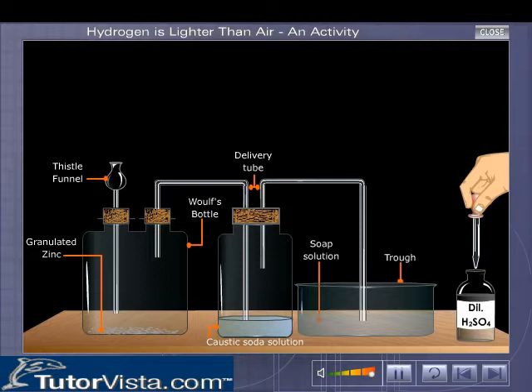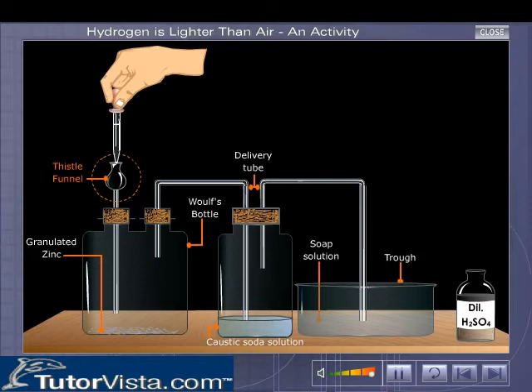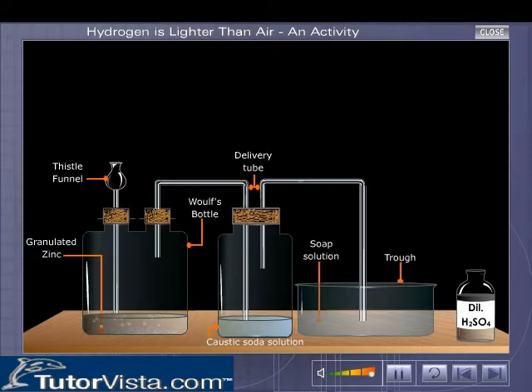Acid is dropped into the Woulf's bottle through the thistle funnel. The hydrogen gas formed is made to pass through the caustic soda solution so that it becomes free from acid. The gas is then passed through soap solution taken in the trough.